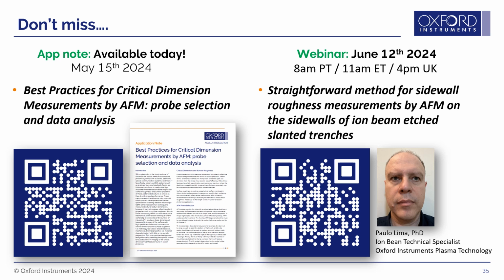So if there were any processes happening, polishing or anything like that, you want to make sure that there is no material covering your sample, because then you have a chance of dirtying your tip and losing the resolution or even losing your tip. Can't really think of anything else specifically for these kinds of measurements, but as for any AFM measurement: clean surfaces and the right size to fit your AFM.